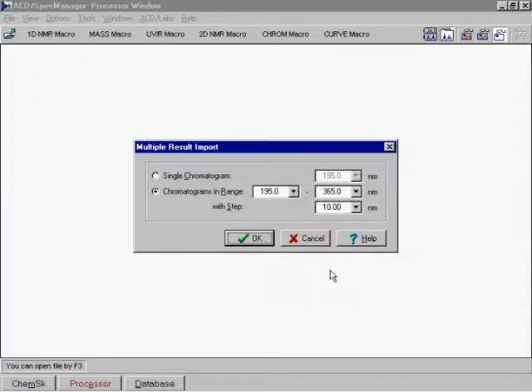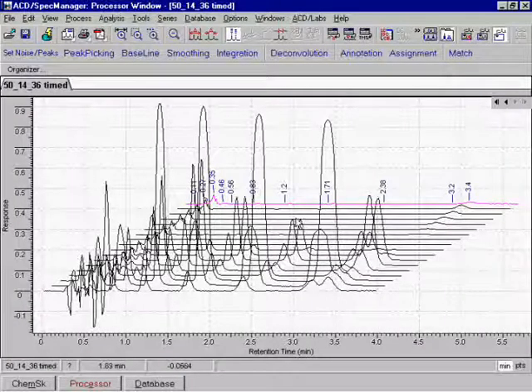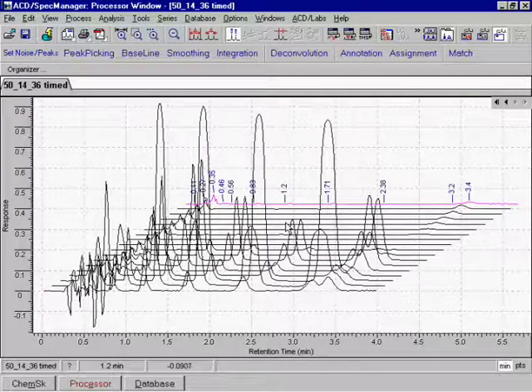The imported document includes a series of chromatograms with the corresponding peak data.